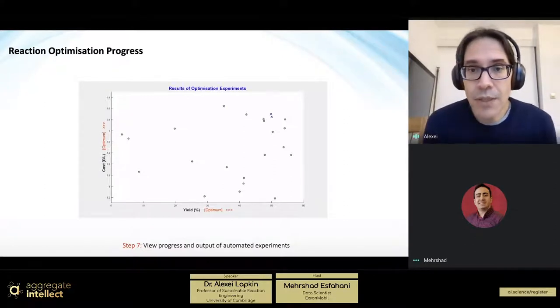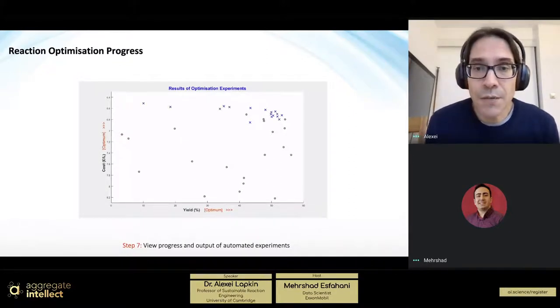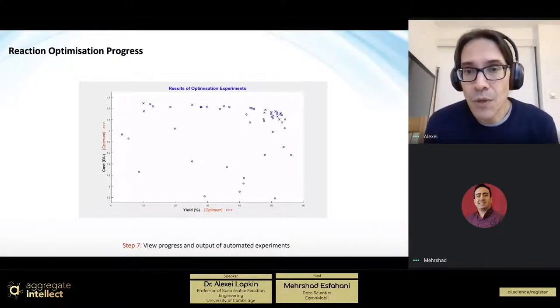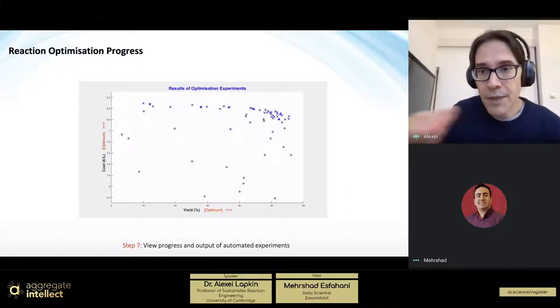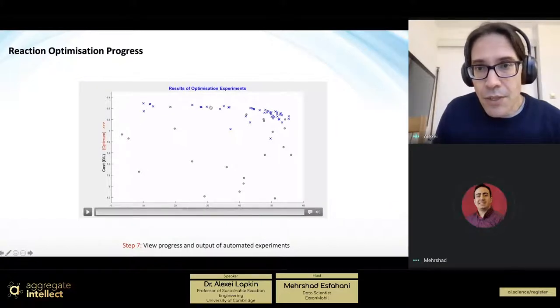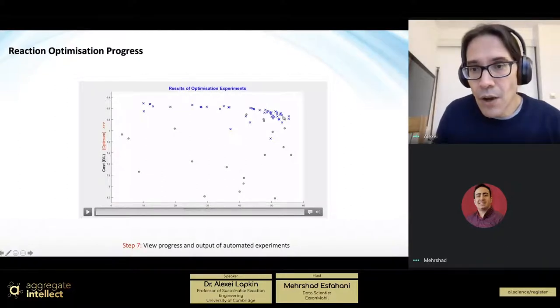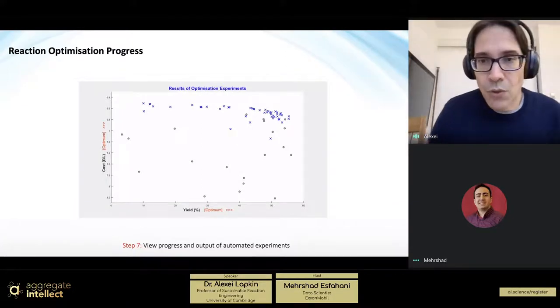And then you start running the actual optimization experiments, which are then congregating fairly close to where the optimal solutions are. So as you can see, they're fairly densely concentrating at the top right line and top right corner. So this line is the set of Pareto optimal solutions. So all of the solutions there are correct. They're all optimal, and you just need to choose the one you like.